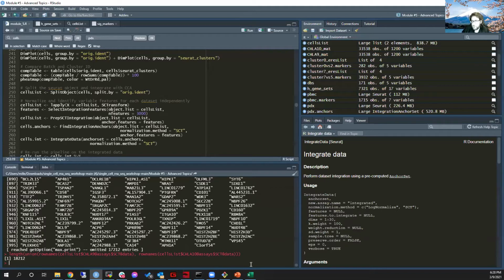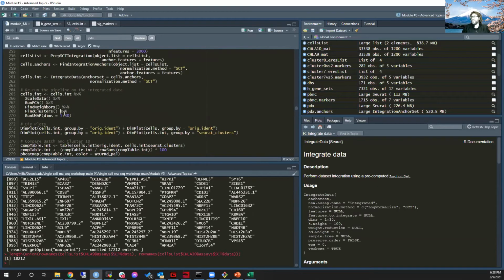You can also pick through their source code for an hour and probably find the same thing, but that's kind of draining. So I actually think the SCT assay might be a good one to use here, specifically because in general, you're going to have fewer genes in it that have 0 in every case. So, all right, let's go ahead and run through this. That was a good challenge question. Thank you. I don't often get stumped. That was a good one.